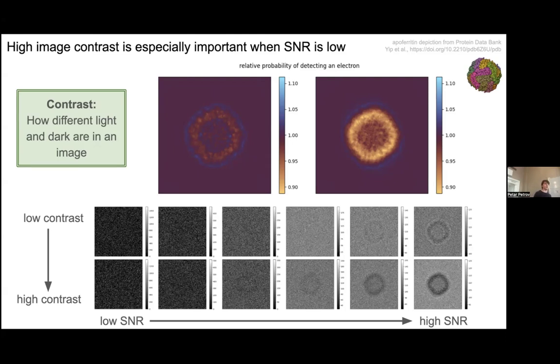So sometimes you look at purified proteins, but you can also take a section of a cell and freeze it. And you usually have to mill that down, because it's actually hard to pre-prepare a section of a cell at 100 nanometers and then freeze it. So they'll make it like a micron and then they'll cut it down. But yeah, it's a great question.